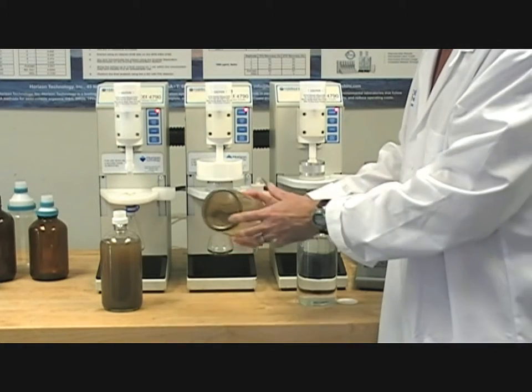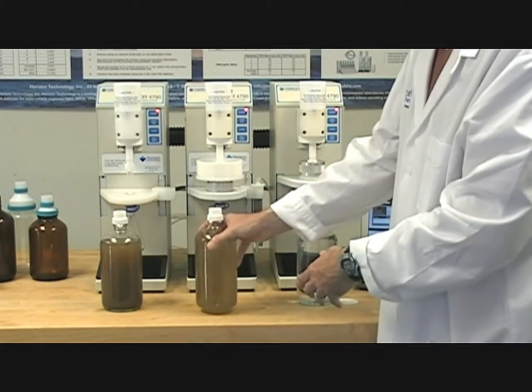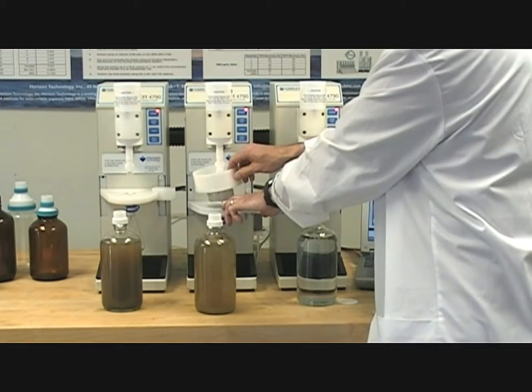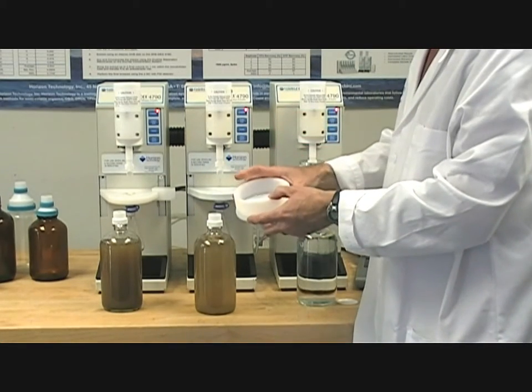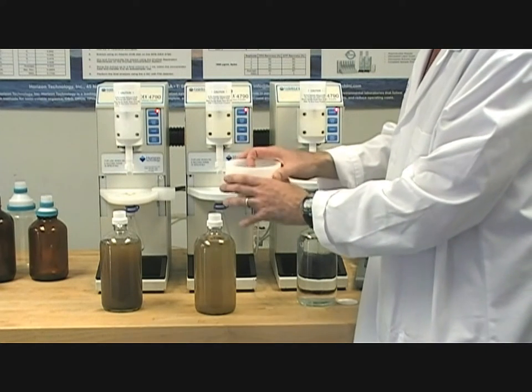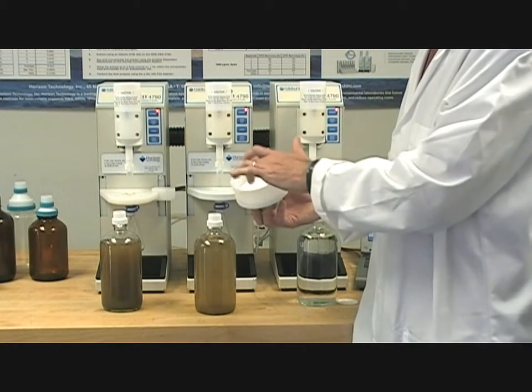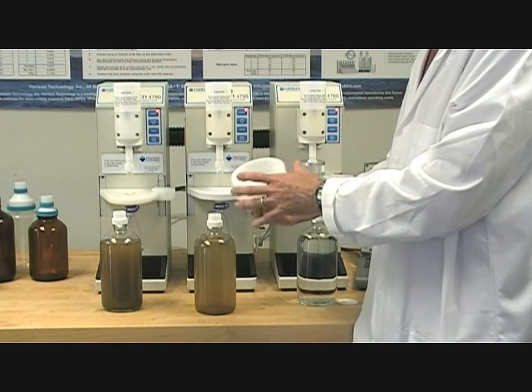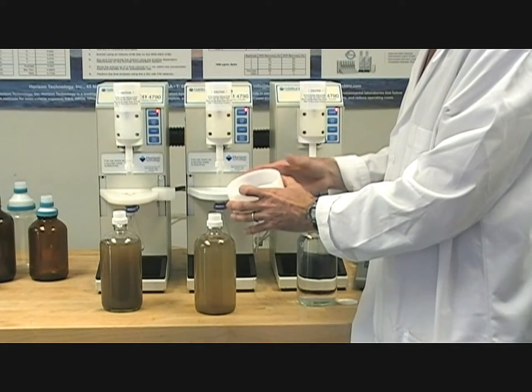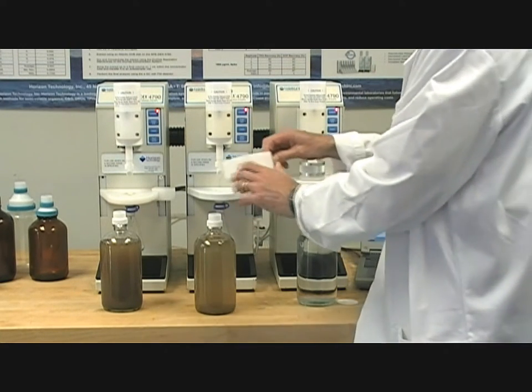With the moderately contaminated sample, which has about 6 grams of sediment in a liter of water, we're going to use our fast flow sediment disk holder. In this disk holder, we have the ability to put our 47mm disk below, and then a series of pre-filters in this large chamber above, where there's ample surface area to help contain and block the sediment from clogging the analytical disk, but include that sediment in the extraction.